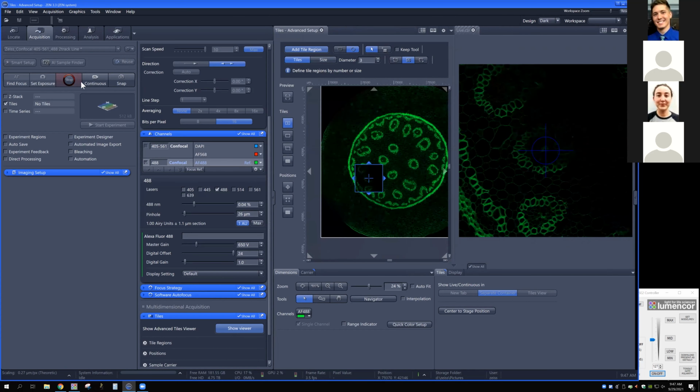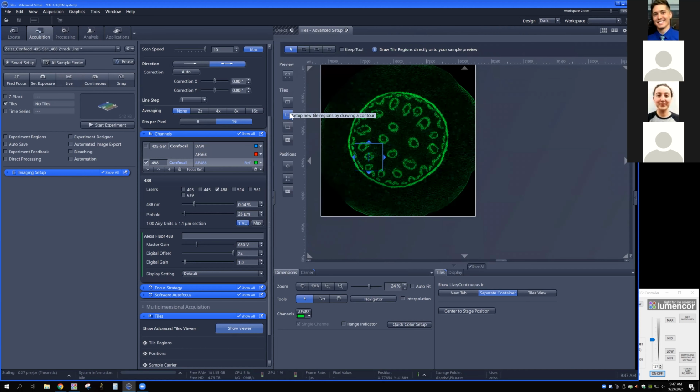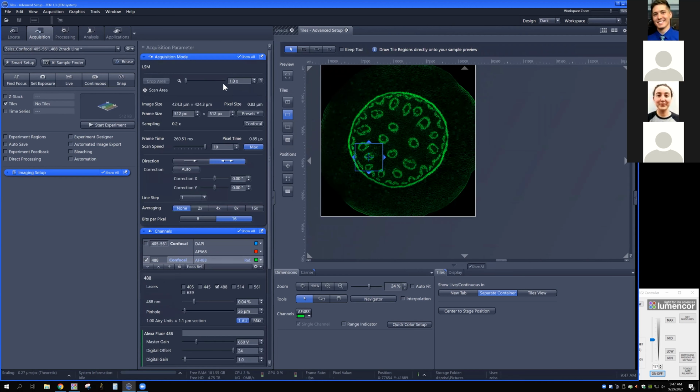All right. So to continue our tour of the tile regions, hopefully this one seems relatively straightforward. If you have questions, please just let me know. Where we really get into more powerful and flexible ones is with the next tool that we have right underneath. And this is basically where we can draw whatever we want. And so let's say, I'm going to zoom this in so that it looks like we're dealing with a smaller area, something like that. There we go.